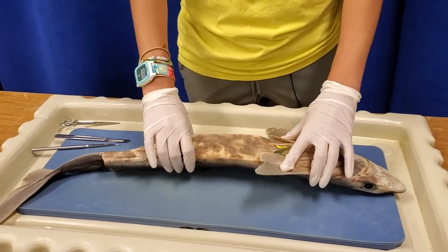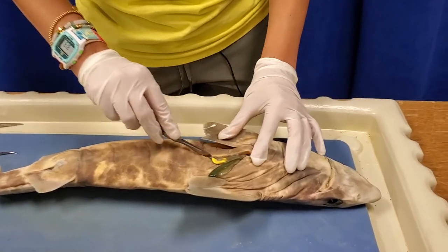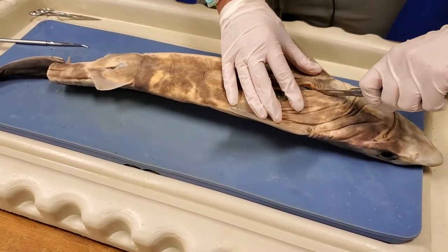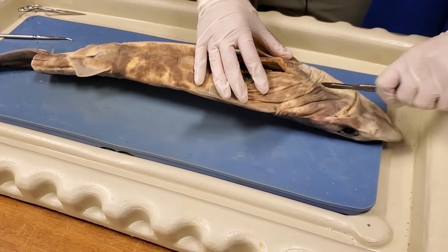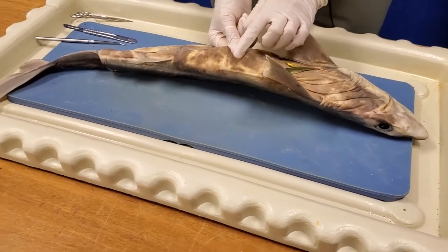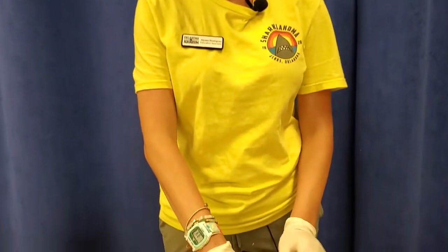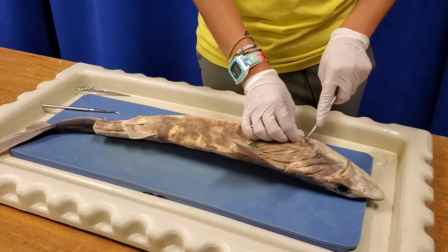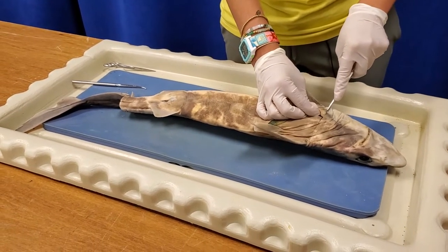I'm going to make a cut on the ventral side using the cut that's already here. Something interesting about dogfish skin — and any shark's skin — is that it's kind of sandpaper-like. That's because all sharks and rays have skin made up of something called dermal denticles, not regular fish scales. These dermal denticles create a small amount of drag that actually forms a bubble of water around them, reducing overall drag, making them fast and quiet — which is important for a predator. Sharks were actually the original sandpaper; people in medieval times used shark skin to make furniture.